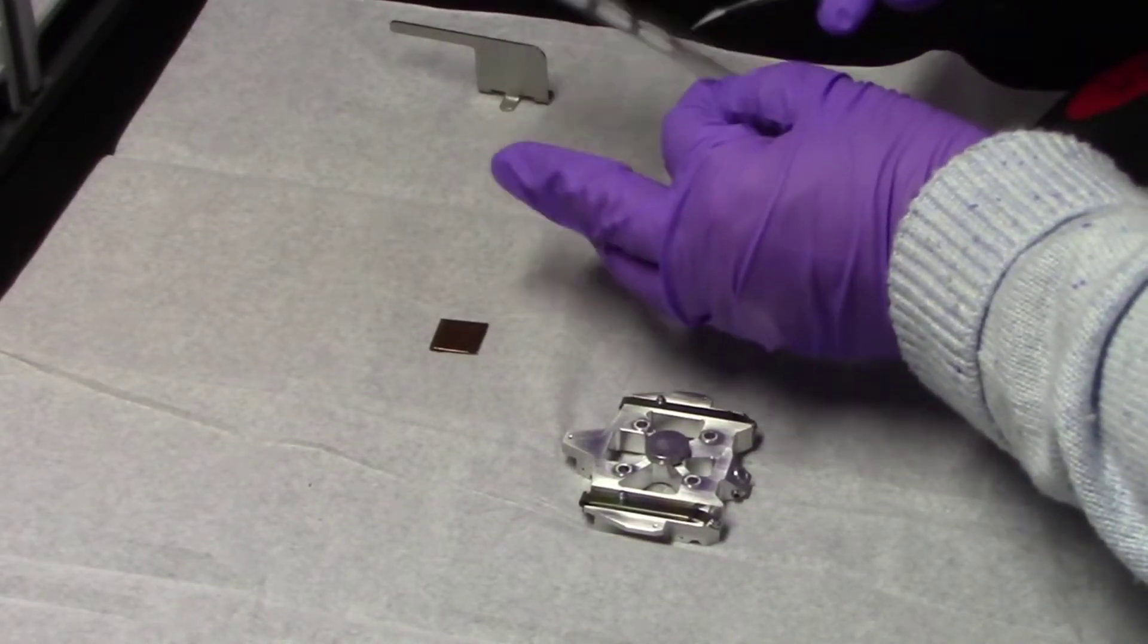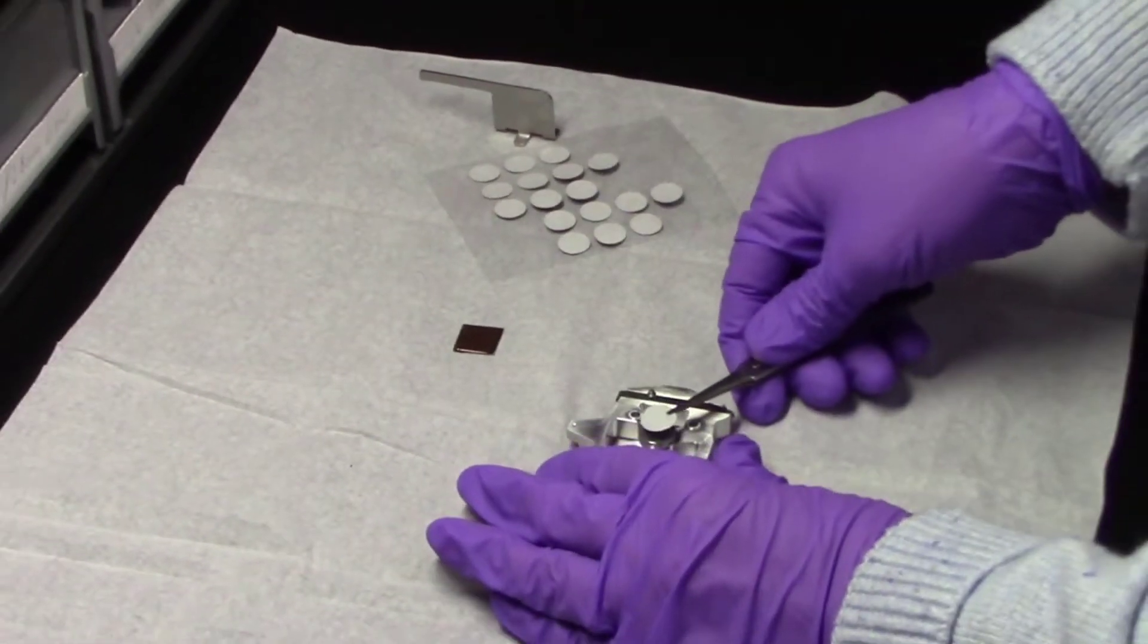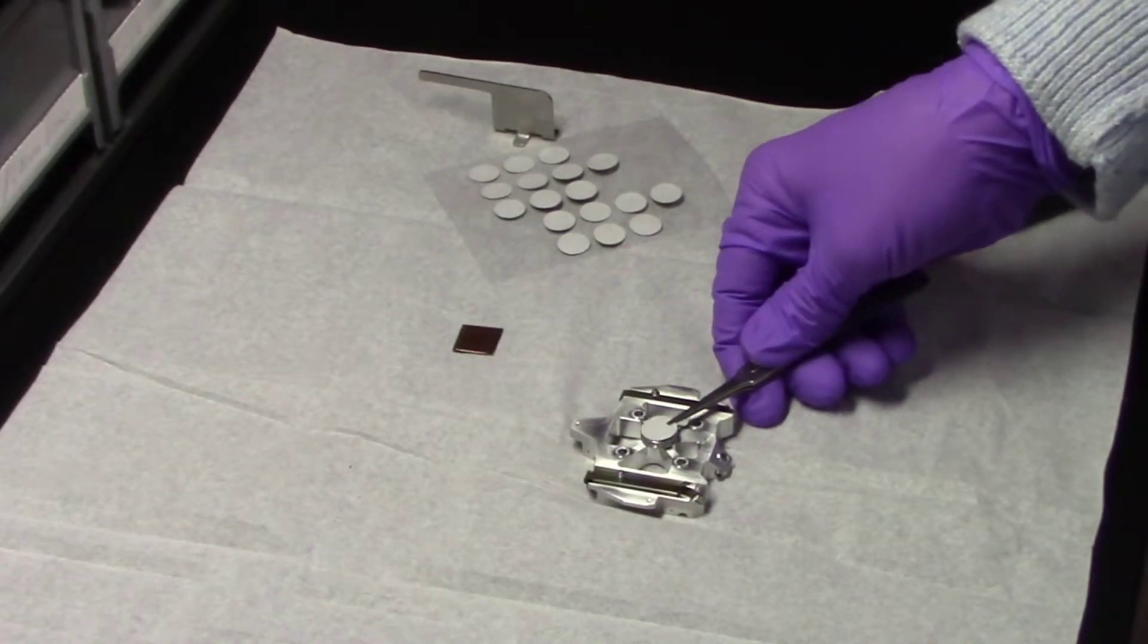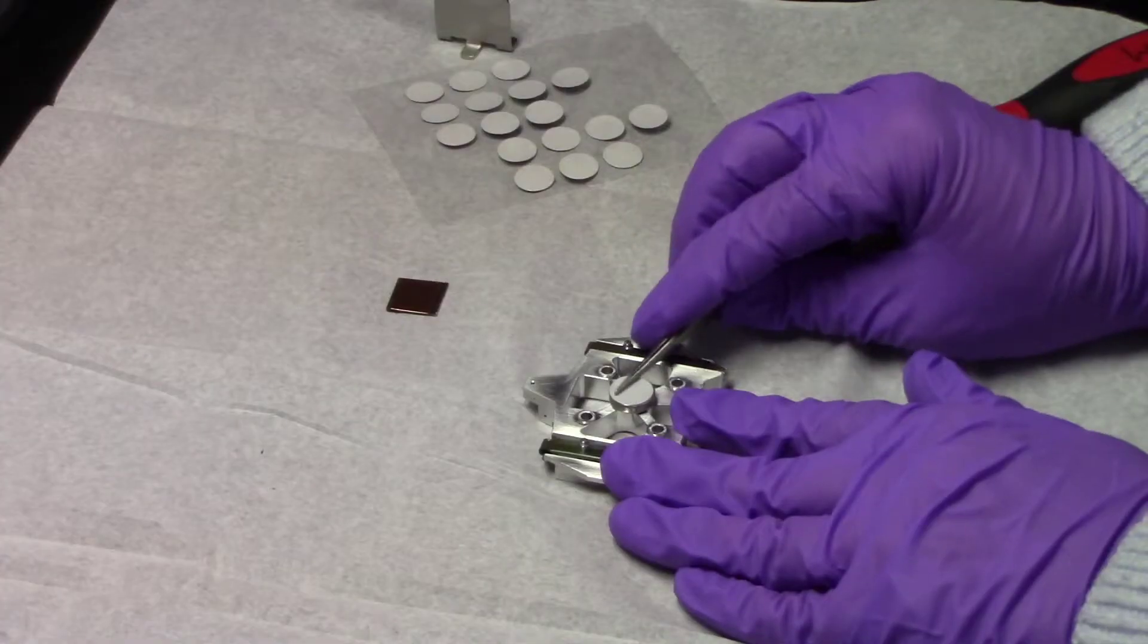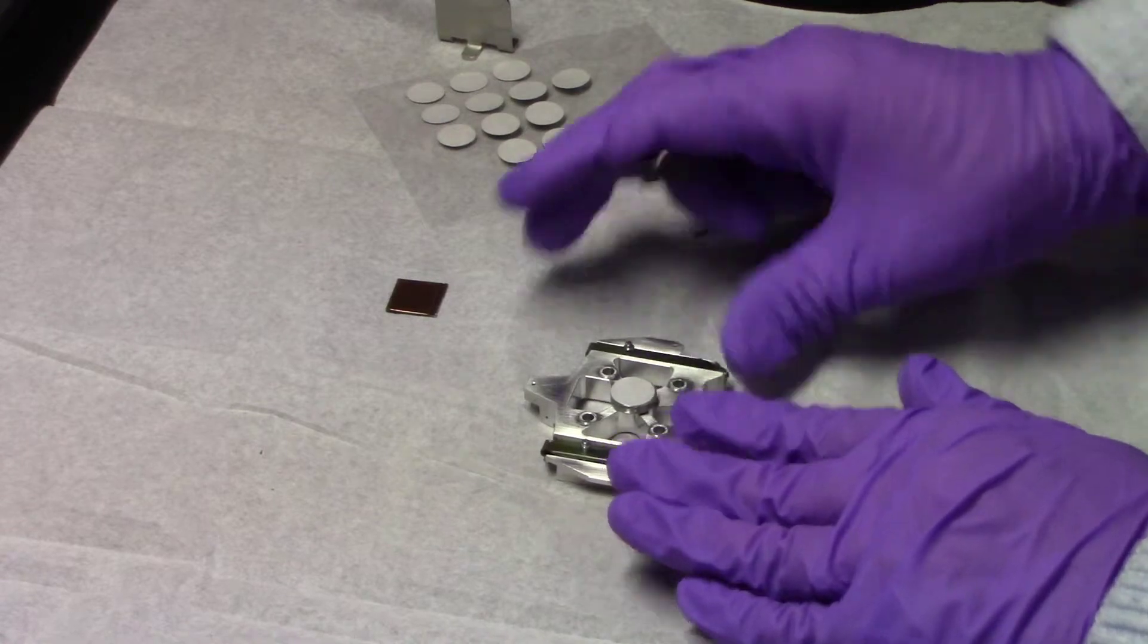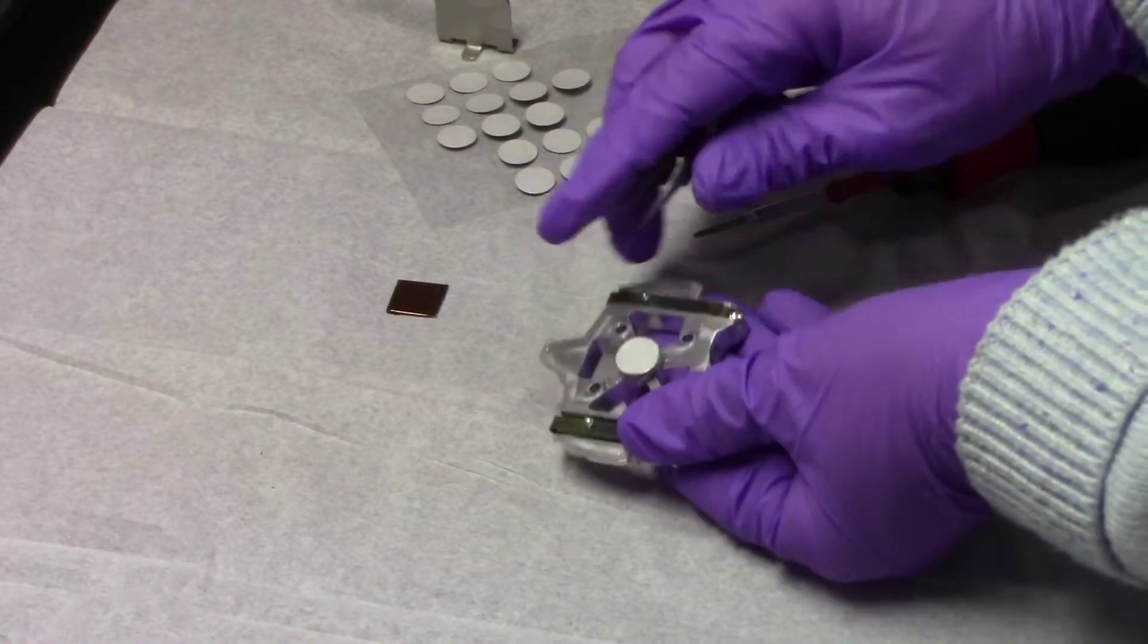Using the tweezers, remove a carbon tab from the backing sheet and place it on the stub. Gently smooth out the tape and then remove the release liner to expose the adhesive.